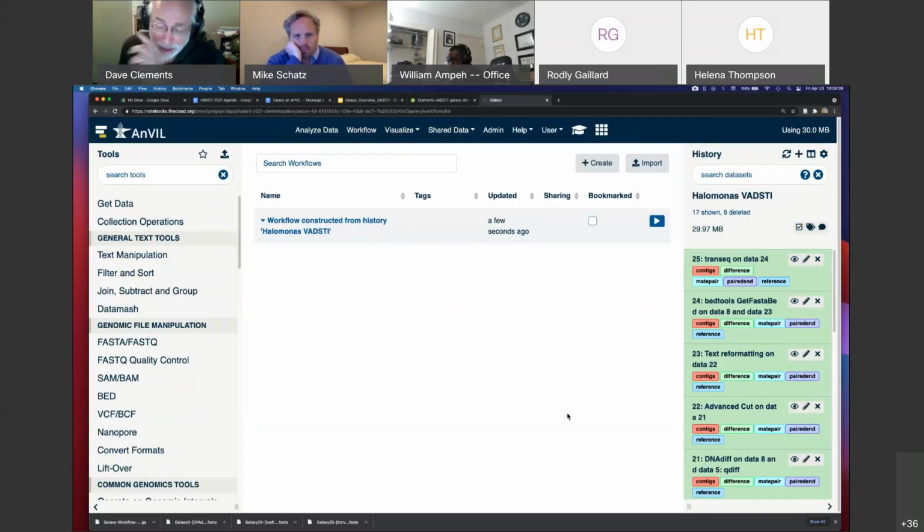So William, I'm going to try to answer your question. It is a text file, and it is semi-understandable by a human. I think it's XML. I'm not positive of that because I never look at them. High-end users actually do manipulate the text file itself. But every biologist I know who's not a hardcore computer techie person manipulates the workflows in the editor that I just showed.